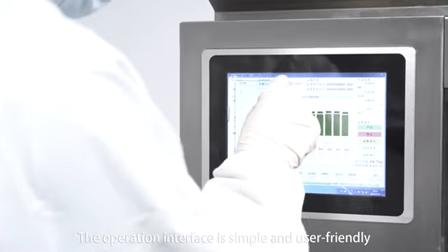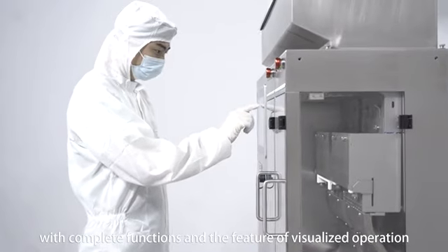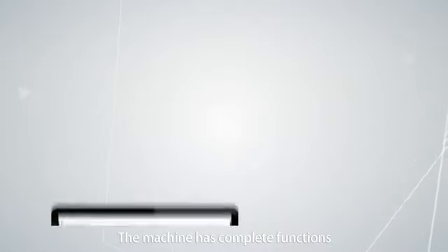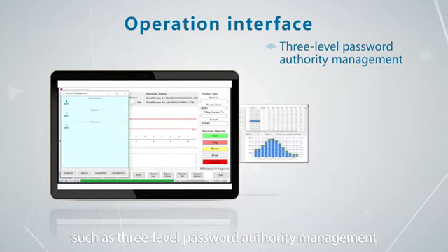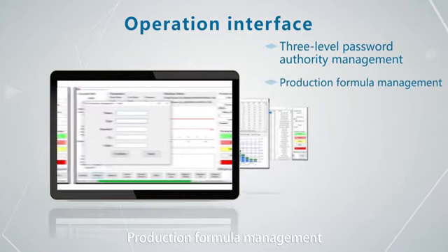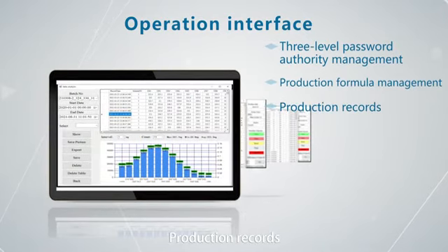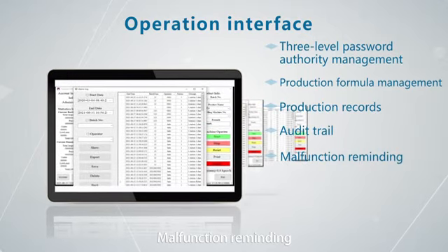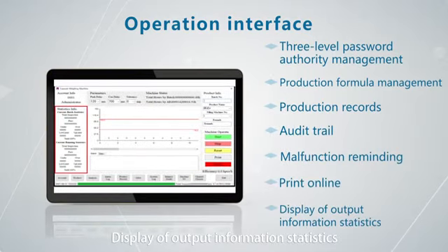The operation interface is simple and user-friendly with complete functions and a feature of visualized operation. The machine includes three-level password authority management, production formula management, production records, audit trail, malfunction reminding, print online, and display of output information statistics.